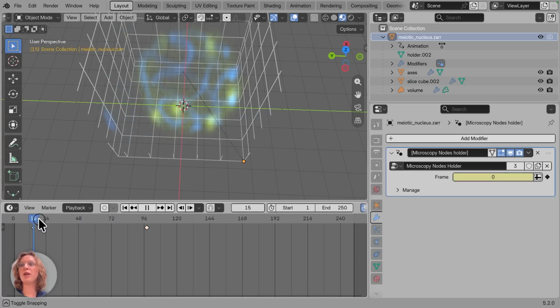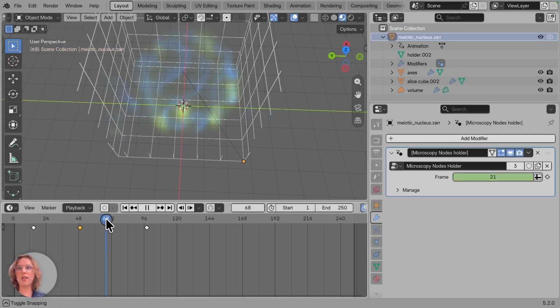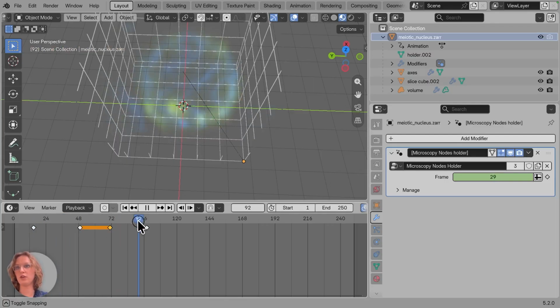Then what we can also do, if we want to have a pause in between, is we can set a new keyframe. For example, here the frame being read out is 14 at frame 49, and we can press I, and this will set that at this specific frame, frame 14 should be playing. If we then move this through time to frame 70, and we again set frame 14, we can hover and press I again, and then we see that we have frame 14 in this whole region, and then the animation continues as before. So this is how to create a pause in our time axis.